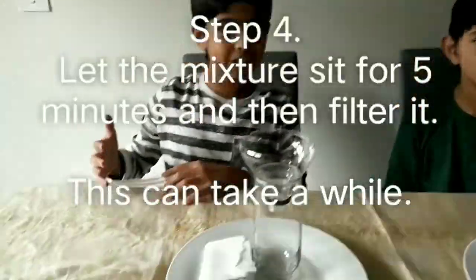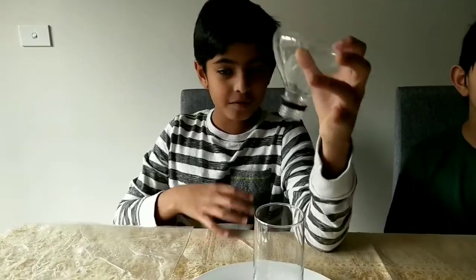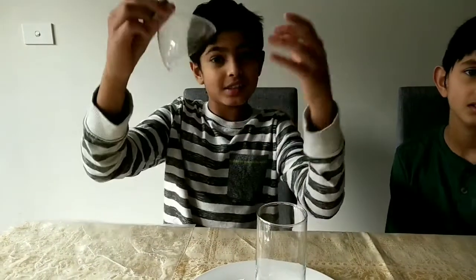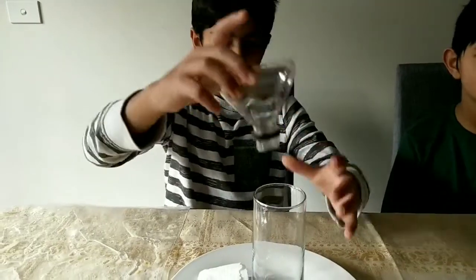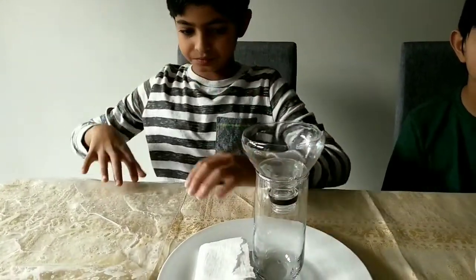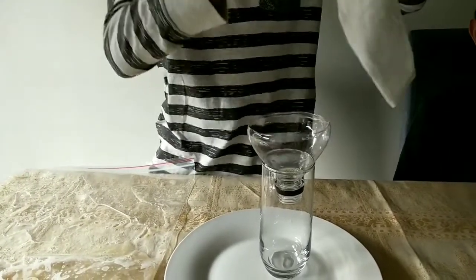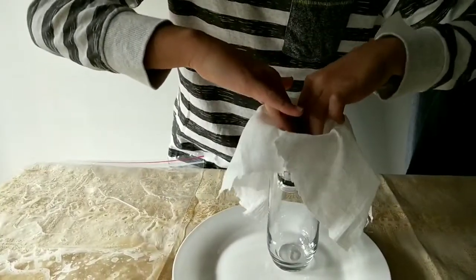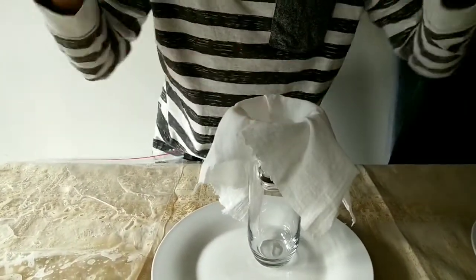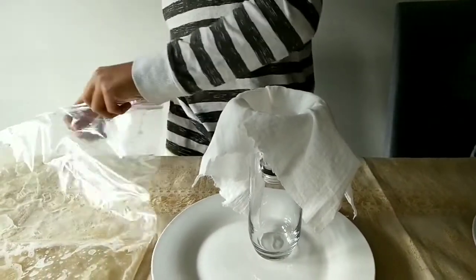We've let our mixture sit for about five minutes. Now we're going to be filtering it. Before we start, we made our own funnels. If you don't have one, you can make one: take a plastic bottle and cut the top part off. Take the funnel, put it over your cup, then take a muslin cloth or coffee filter and place it over the funnel. Now we're going to be pouring the mixture through gently.